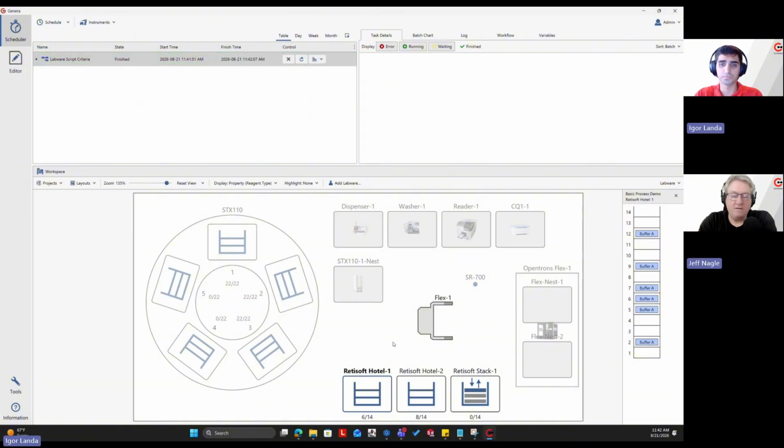And now here's the key to this. Viewers, you may have seen that I did not select a specific location. We told the software, this is what you need to find. You find them, I'm not telling you where they are. So it pulled from random locations where it saw that value, which makes it really great because we didn't have to make an explicit declaration as to which shelf those things existed on. Genera knew based on that property.